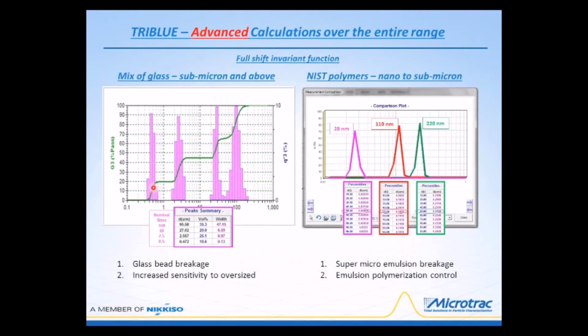On the other hand, if you're trying to make glass that's very, very small, down in this region here, which is on the order of, I'm going to say, half micron, then if the sizes are getting too large as you go through your process of making this, you'll know when to stop the process and avoid making these larger particles. Because if this is the material that's desirable to be made, then there would have to be another step in the process to remove any of these large particles that might develop.